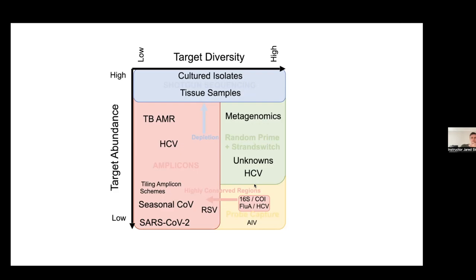Javier? Yes, hello. So what type of samples would be difficult to extract DNA from in quality enough to do really good sequencing? The second half of your question, I heard what type of samples would be difficult, but then I missed the rest, sorry. So in terms of sequencing, which types of sample can be harder to obtain good DNA quality in order to get a good, high quality sequencing?